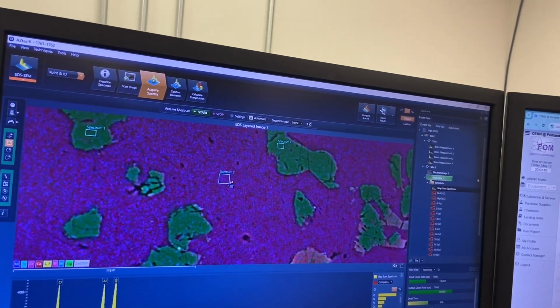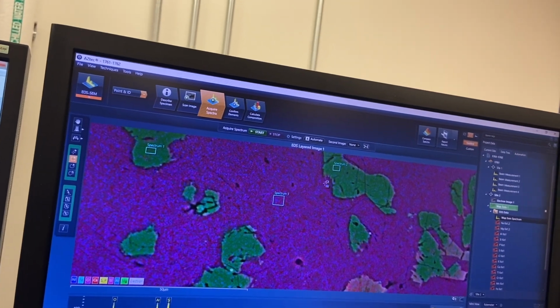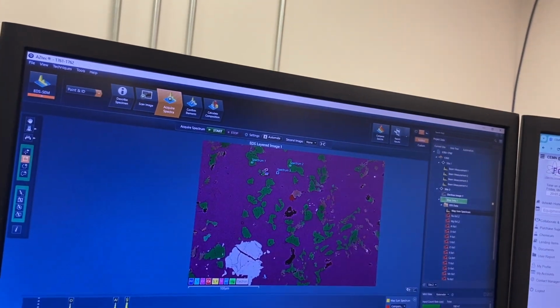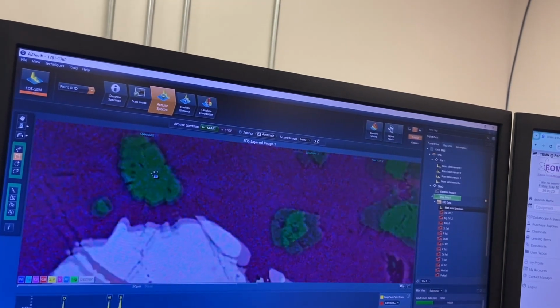And so rule number 1 has to be in a mineral phase, so it can't be hitting a grain boundary, it can't be interacting with other things, no fractures. You want to get clean mineral here, otherwise any contamination, and you're not going to get a good stoichiometry on what your chemical composition is. And I'll show you what that means in a bit.